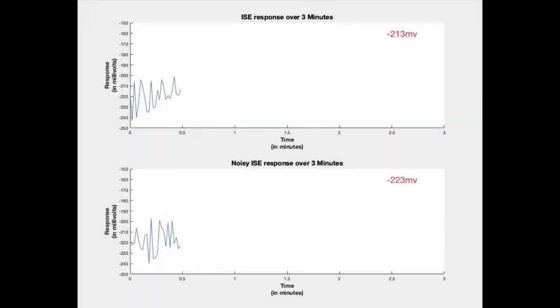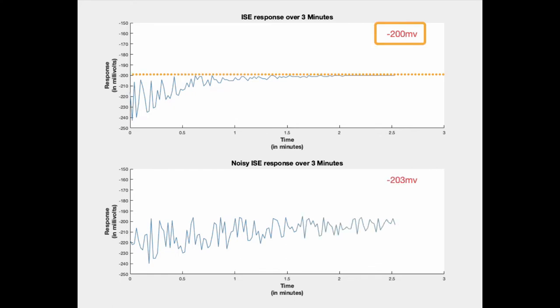For solutions with a high concentration of standard or sample, we should expect the potential reading to stabilize within 1 minute. However, with lower concentrations of the analyte, it can take up to 4 minutes for this reading to stabilize.